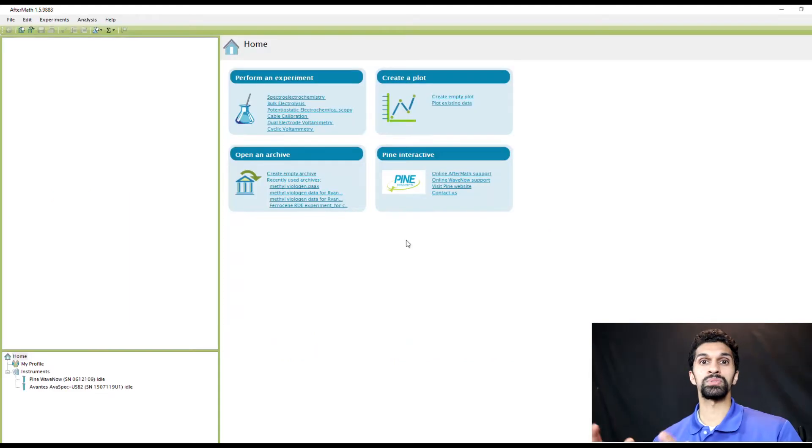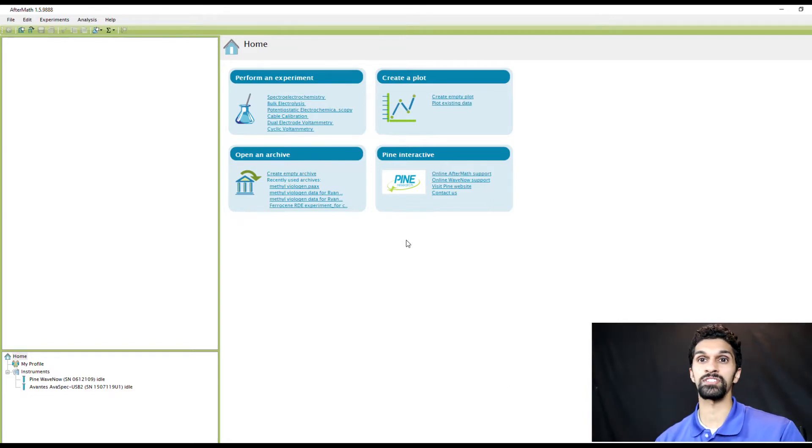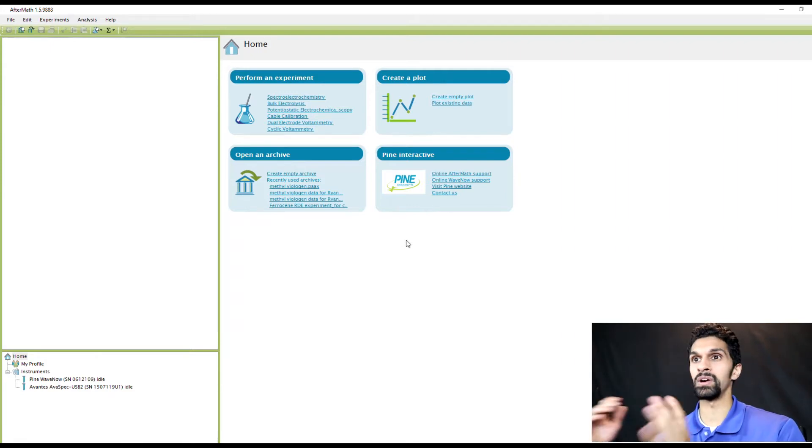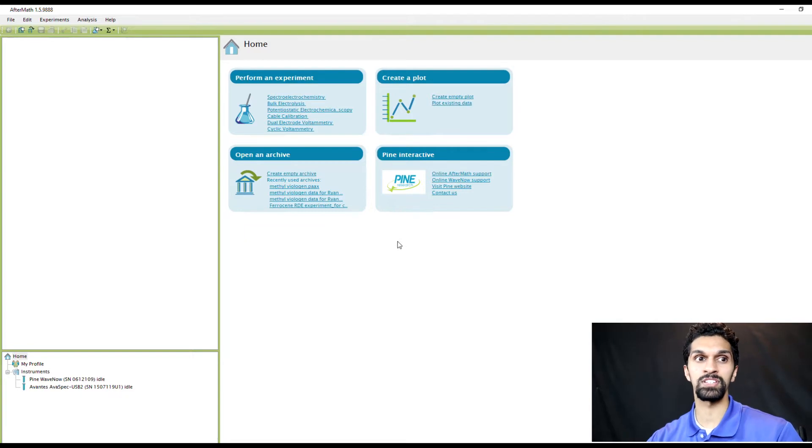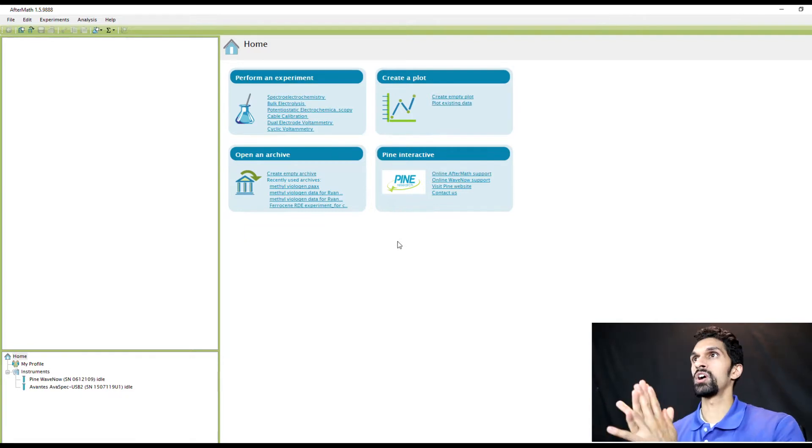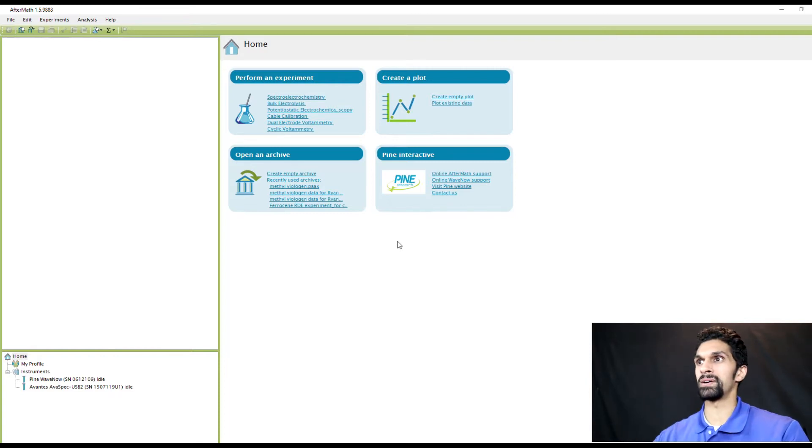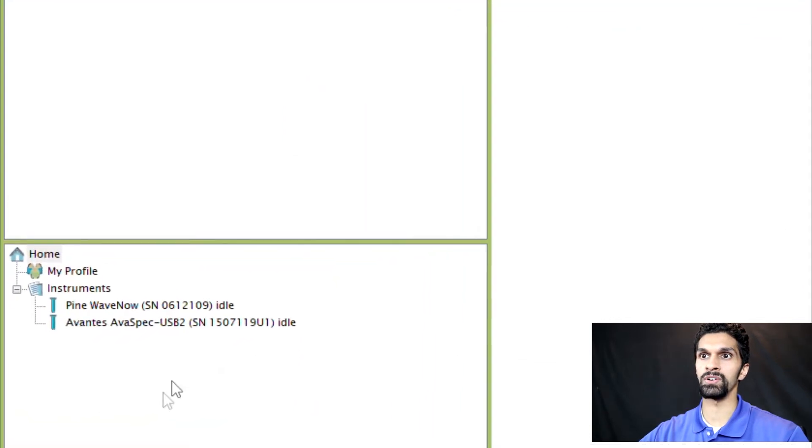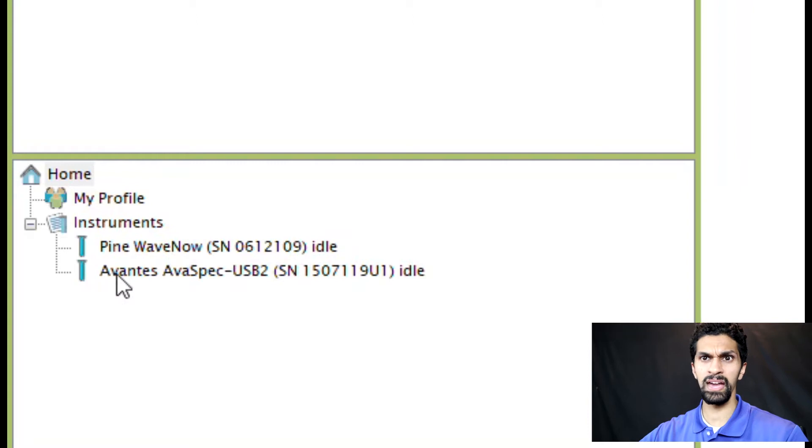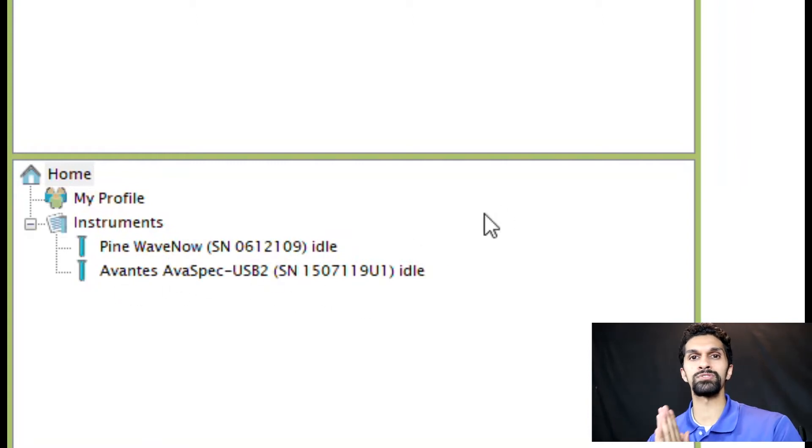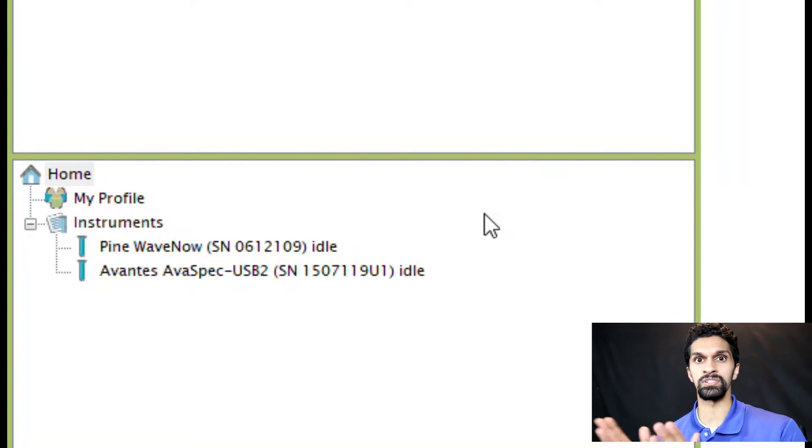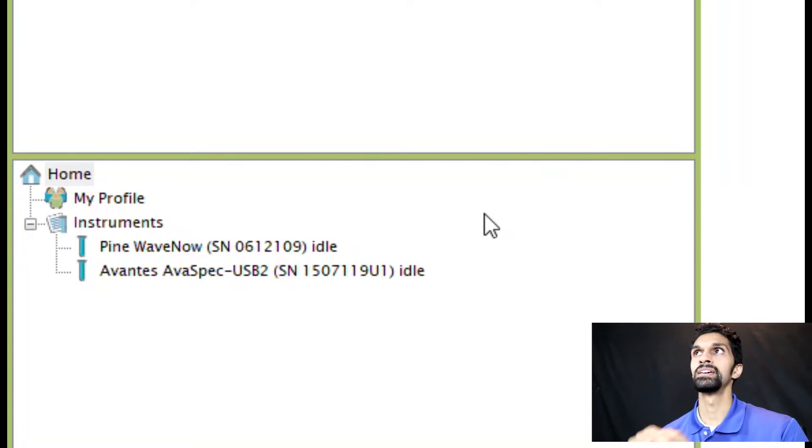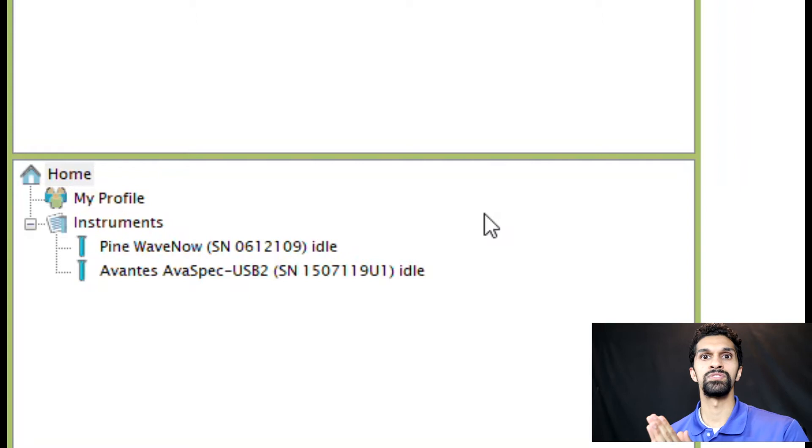Once you have the software and drivers installed on your computer, I now have Aftermath opened up. This is Aftermath version 1.5.9.888. Additionally, I have a WaveNow potentiostat and the Avantes spectrometer connected to the computer. The most important thing right now is in the lower left hand corner you see the WaveNow and the Avantes AvaSPec spectrometer. Right now those two instruments don't see each other. In order to do spectroelectrochemistry they need to communicate, and as they are right now they are not talking to each other.